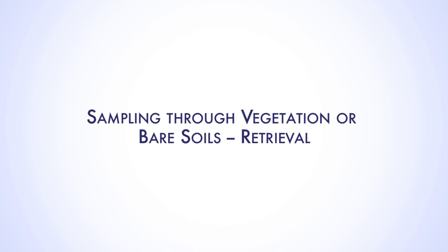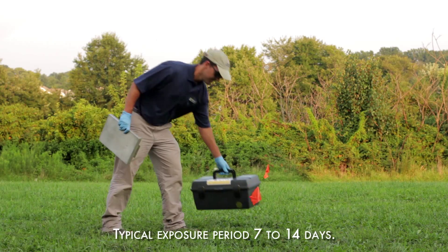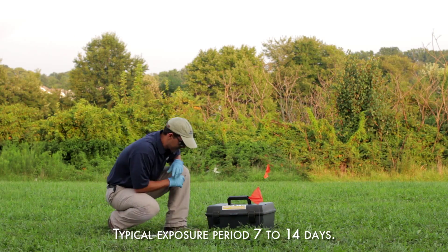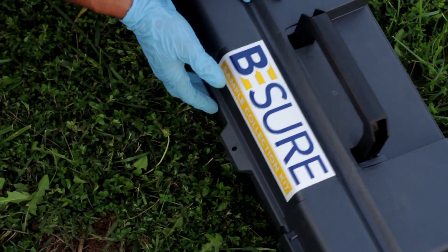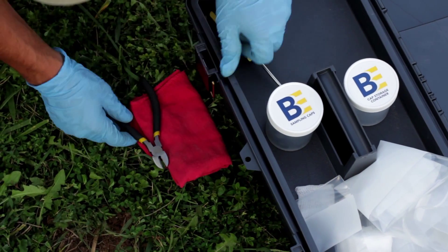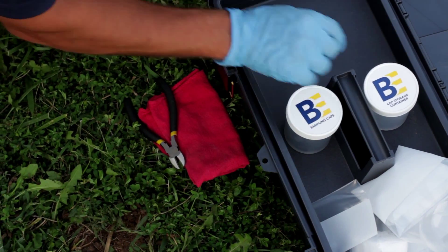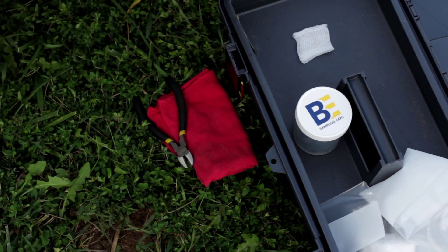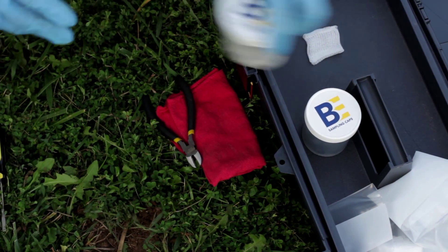Following the exposure period, which is typically 7 to 14 days, each sampler is retrieved and packaged for return shipment to Beacon for analysis. At each sample location, open the sample collection kit. Remove a small cloth or paper towel, wire cutters, and a screwdriver and place these next to the sampling hole. Remove a square of gauze cloth and a solid cap from the cap storage container and place them on the open kit.